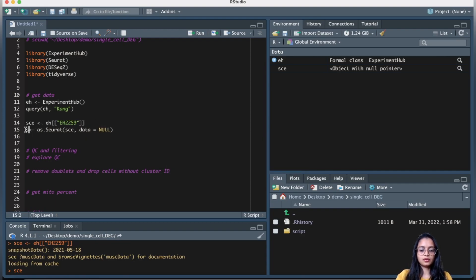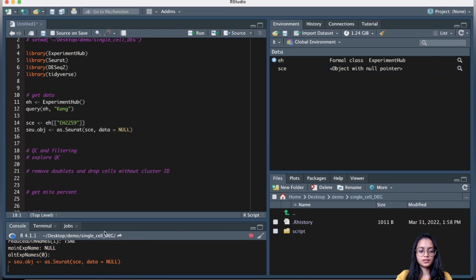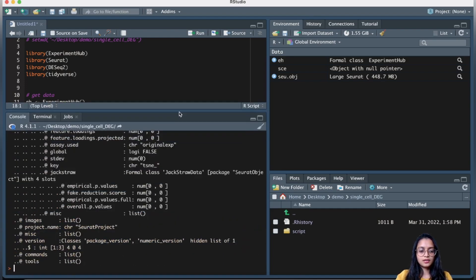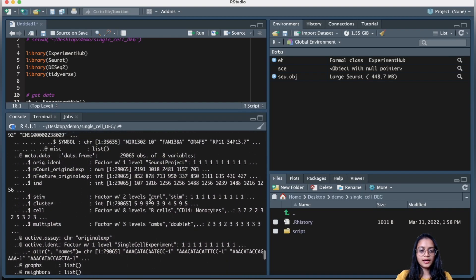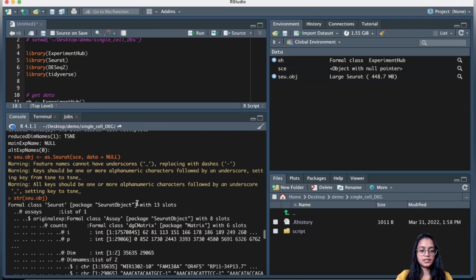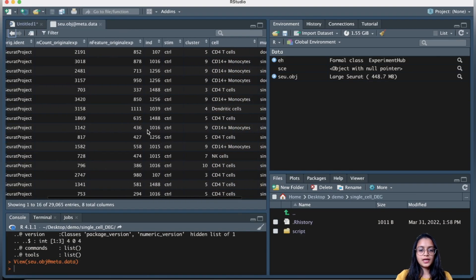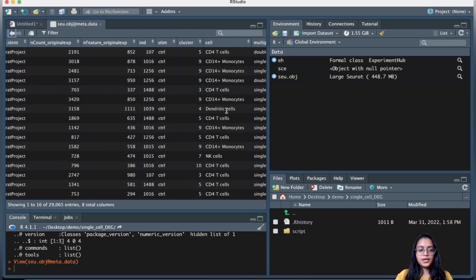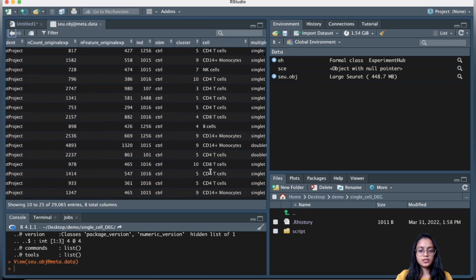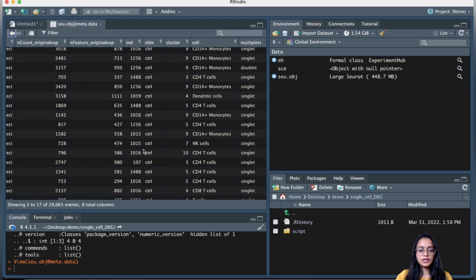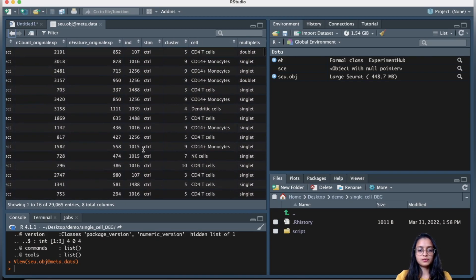Now let's take a look at our Seurat object and confirm we've retrieved the Kang dataset. Let's quickly look at the metadata. Since I'm using annotated data, I want to verify that annotations are present. We can see annotations for each cell as to what type of cell it is, and information on condition — which cells belong to the control and which belong to the stimulated group.